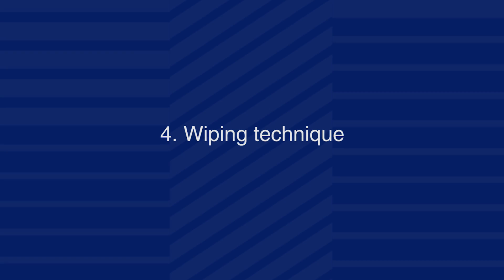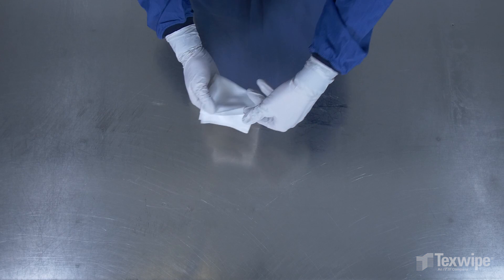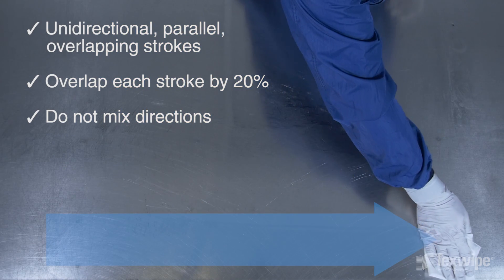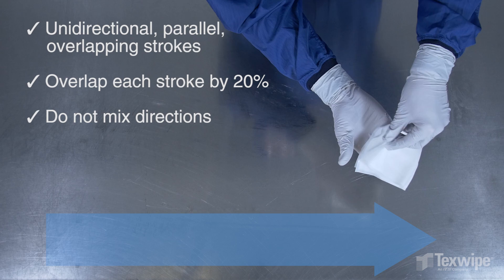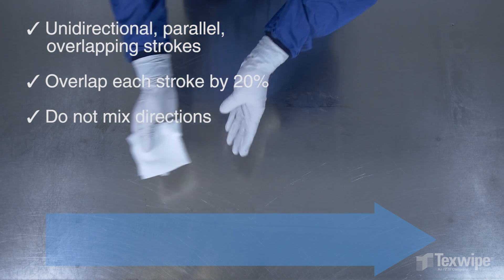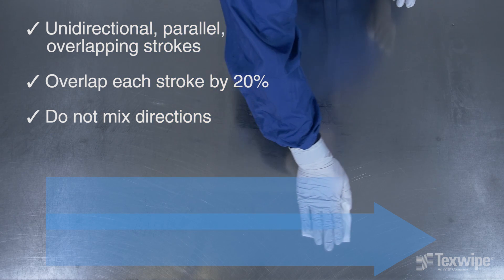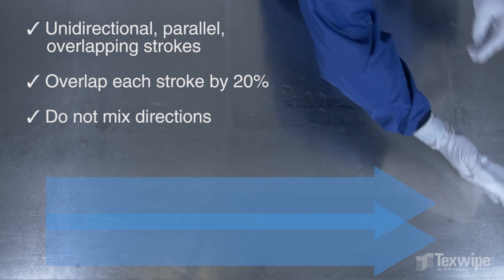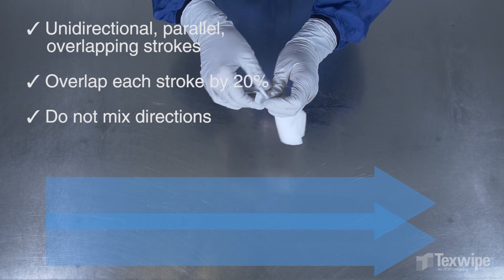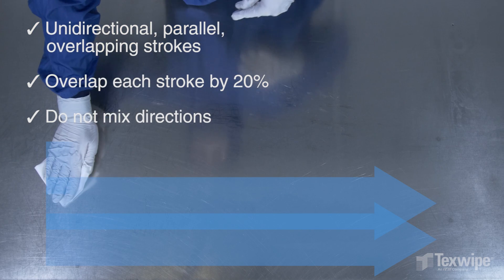Step 4: Wiping Technique. Wiping should consist of unidirectional, parallel, overlapping strokes. Each stroke should overlap the previous stroke by 20% for even coverage. Always wipe from the cleanest to the dirtiest area, starting furthest away from you — which is typically the cleanest area — and moving towards you. Consistently wipe in one direction; do not mix directions.